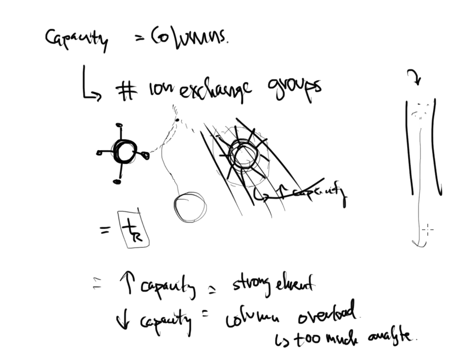So your retention times begin to get modified, and you might see weird things happen in your chromatograms because of that. So low capacities are going to be a problem. You need to be very careful with the amount of sample that you pump into those columns if they have low capacities, right?